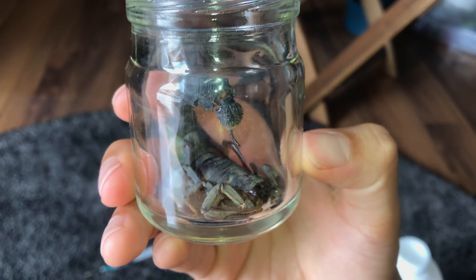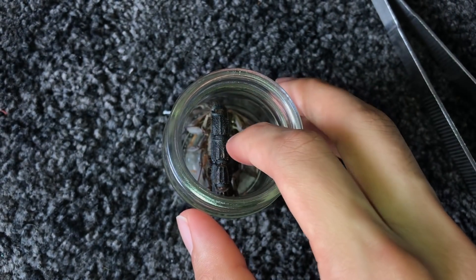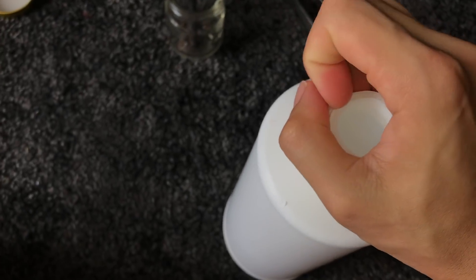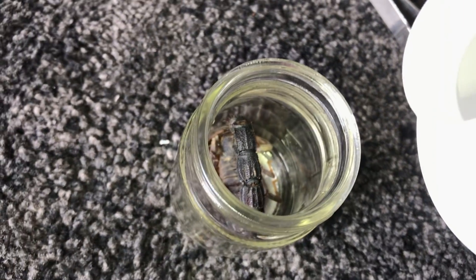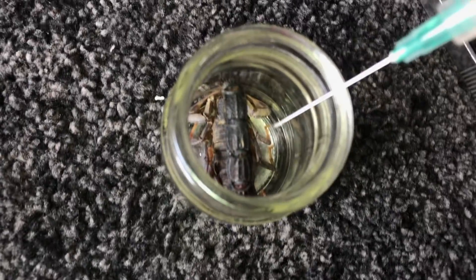I'll push the stinger down a little bit — that looks good! The stinger is a little bit crooked to the side, but I can actually position it straight. There we go, something like that. Now I'm going to pour in the alcohol. I still have some in the syringe, so let's syringe that down first.